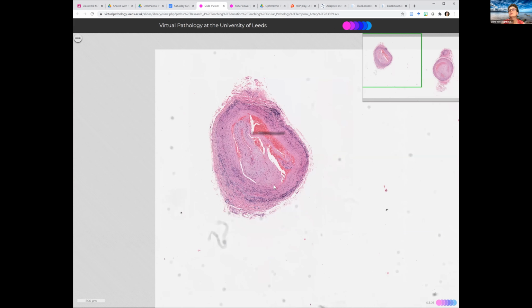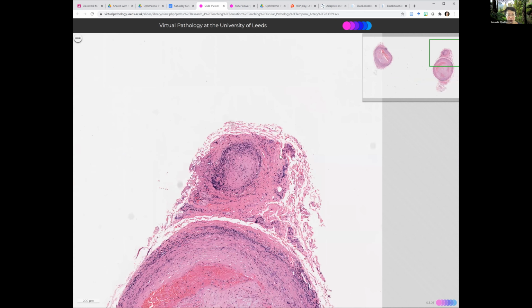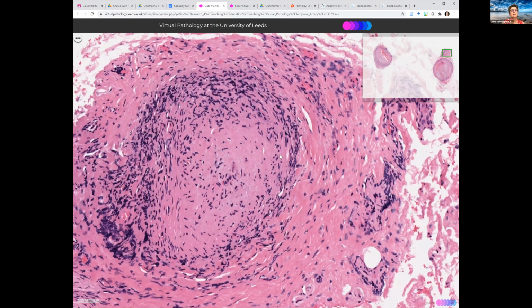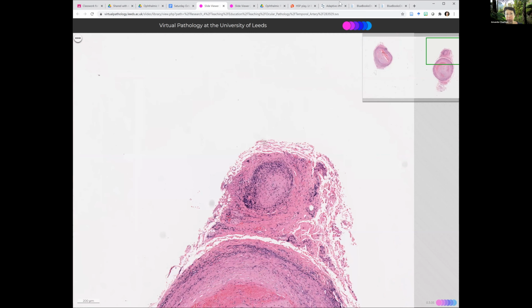I actually thought I saw something in that tiny vessel at the top. Oh, maybe. Okay. The tiny vessel, of course, is completely occluded. Yeah. And it hasn't recanalized. Maybe I was wrong. No, there's none there really. Anyway, all right, let's get back to the schedule.